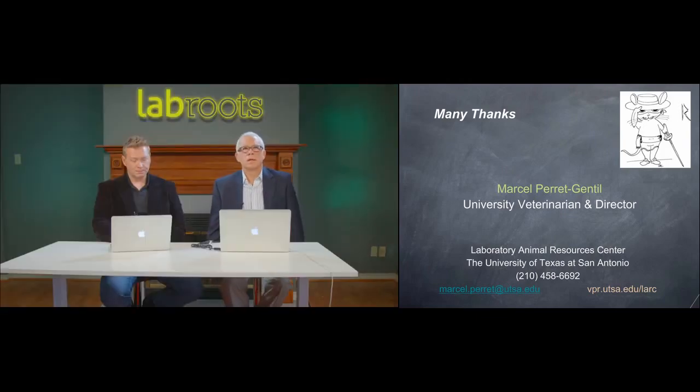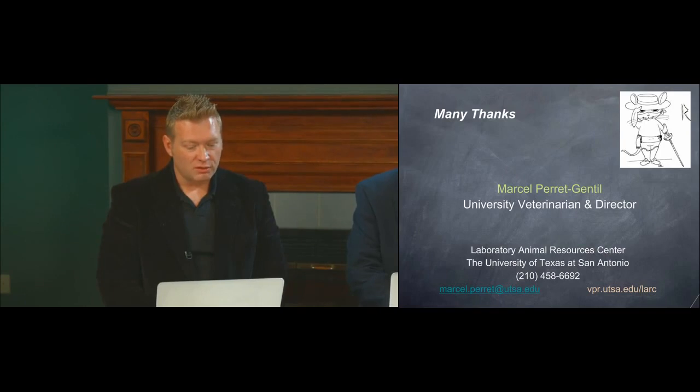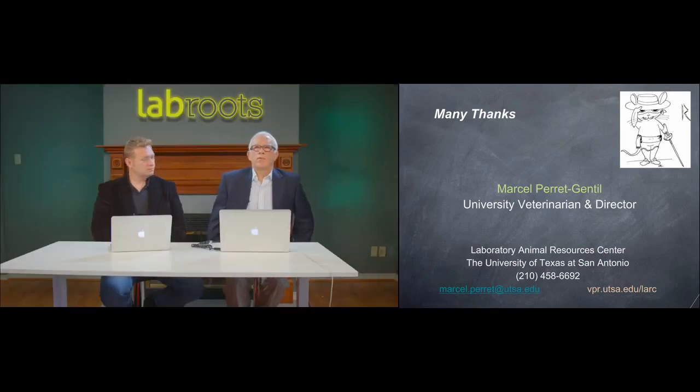Correct. Mitch? Okay. And also, I just want to remind y'all that all these videos we're talking about, the links he showed y'all can go there and access those. The next question is from Trish Lindsay from the University of Calgary. The question is, when using press and seal, I presume it will be placed with sterile gloves. How can it be placed sterilely, and how would you recommend to re-glove once drape has been placed? Let me refer you to our videos where we illustrate that. There is a method of doing this in a non-sterile way, and you'll be surprised.